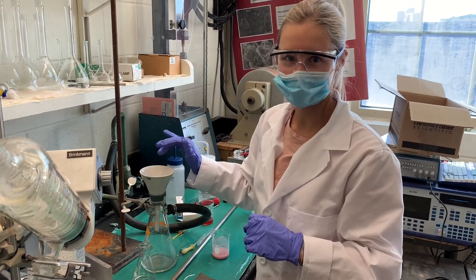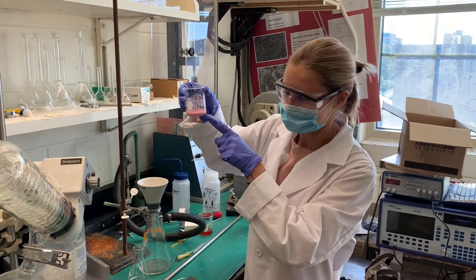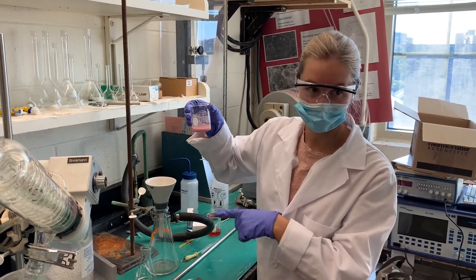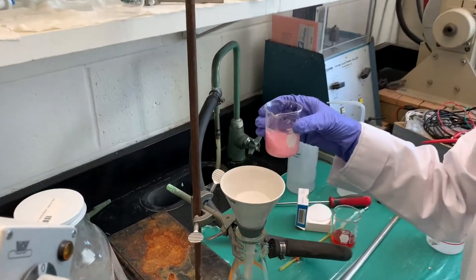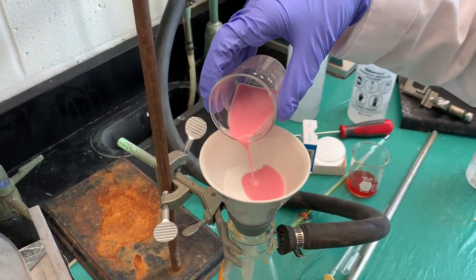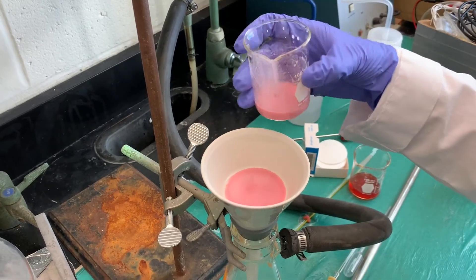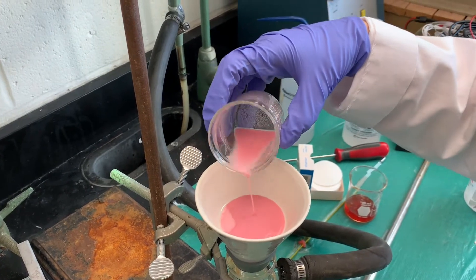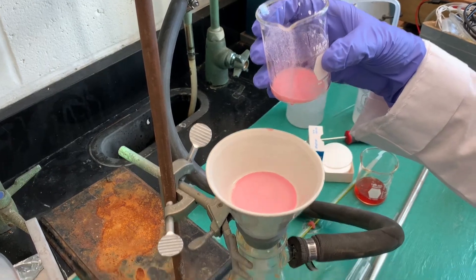We've let the solution rest, and as you can see it's separated into its solid and liquid forms. So now we're going to collect the solid by vacuum filtration. The solid will be collected on the filter paper, whereas the liquid will drop into the flask below.